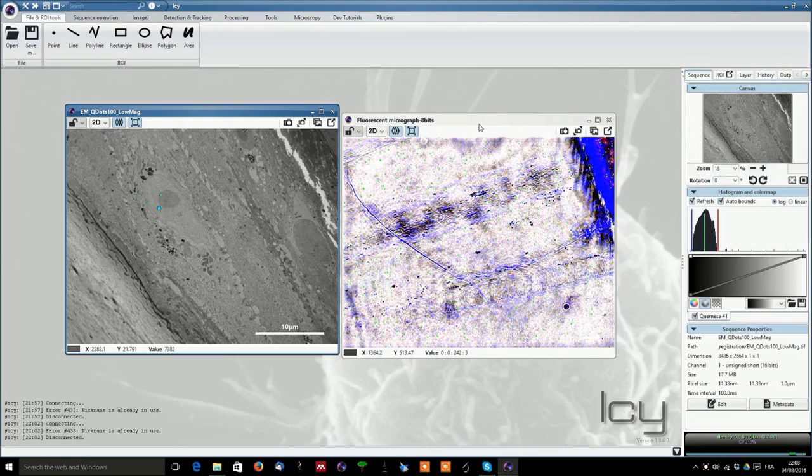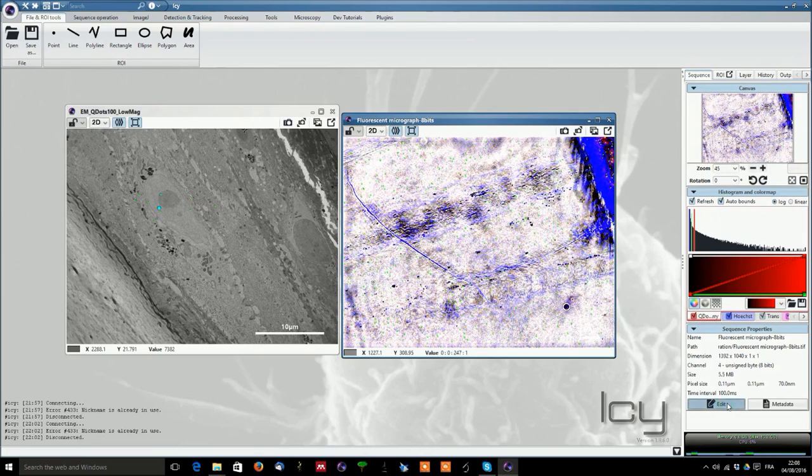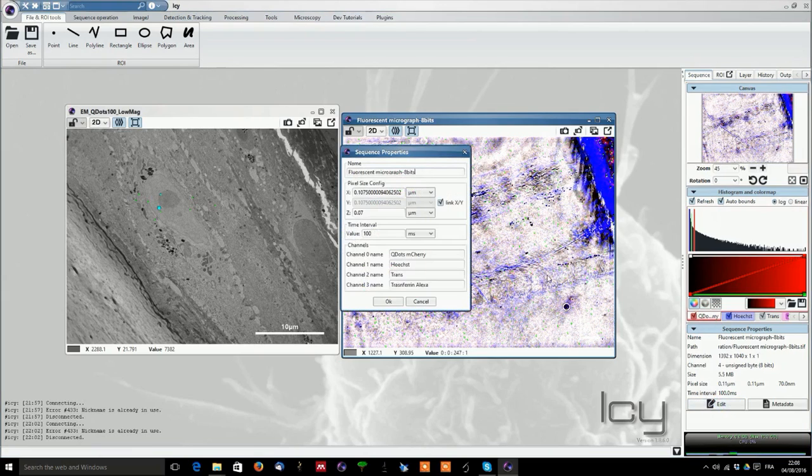Now going back to the sequence image and if we look at the fluorescence micrograph here, we realize that we have several more channels. We have the quantum dots which is also mcherry and if we look at the edit file we will see that channel 0 is called quantum dots mcherry.